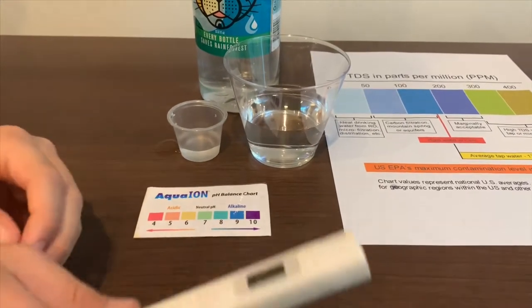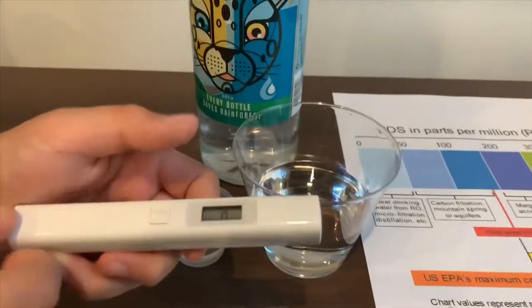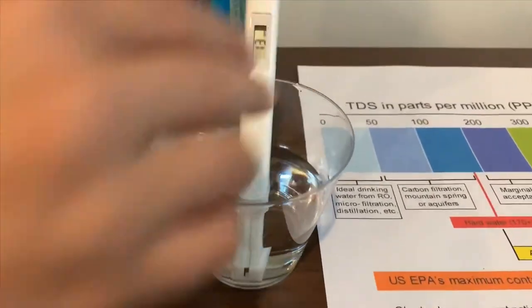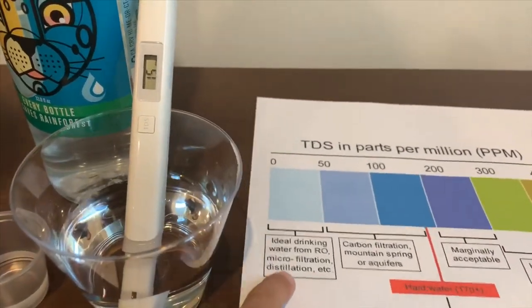If you want to buy this TDS tester, check the link down below. Turn on the TDS tester, make sure it says 0, and put it in. 15. That is ideal drinking water.